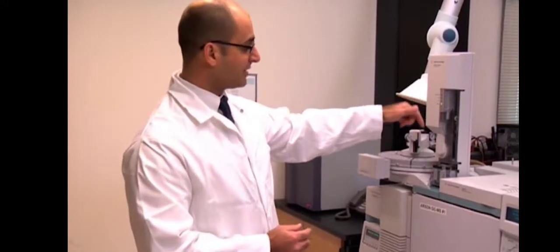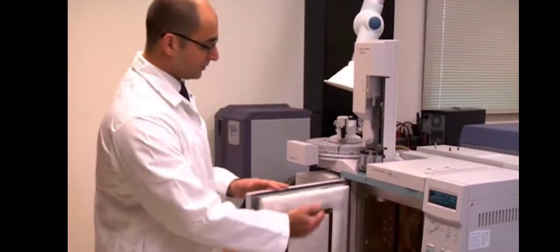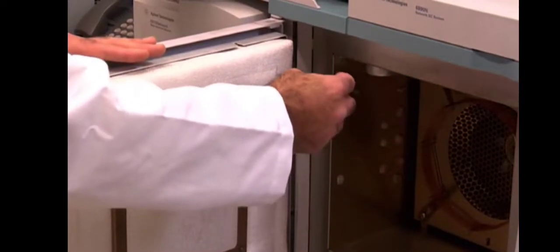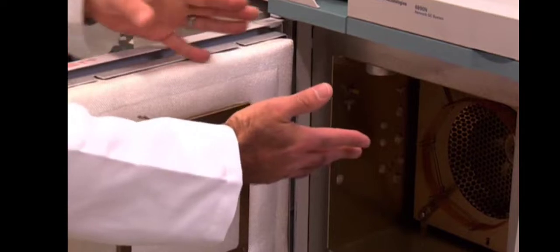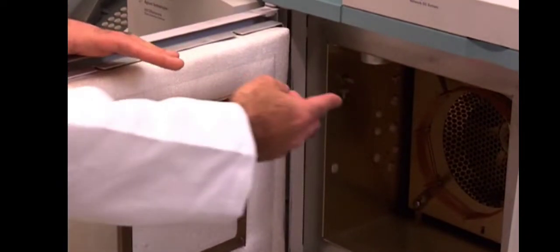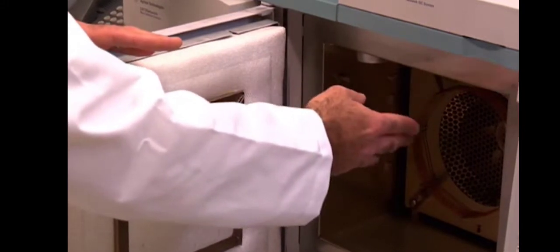The auto sampler would inject the sample into the injection port of the instrument, where the sample would then enter the column, or the analytical column within the instrument. This is a 30-meter column where the separation of all those organic compounds would take place. As the samples go through the column, they're going to interact with the column in different ways. So over time, ideally, you should start separating out individual compounds.